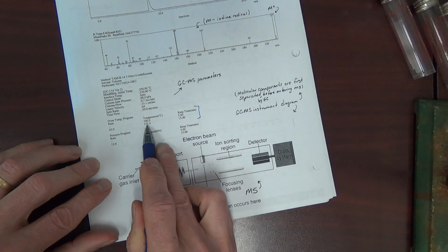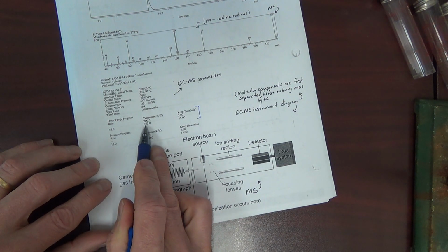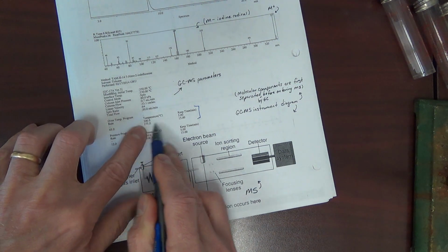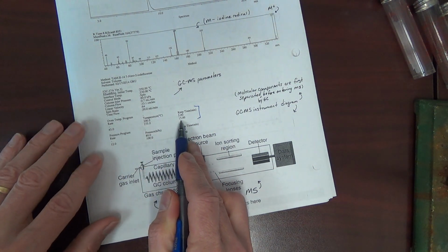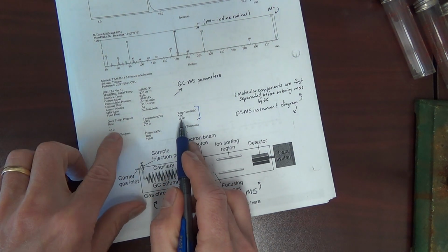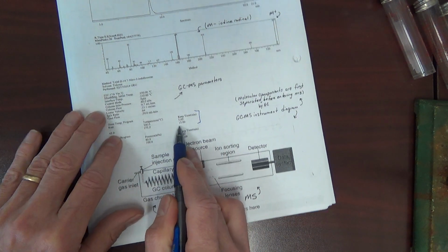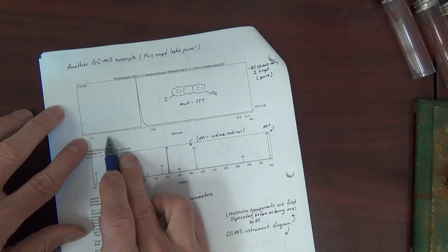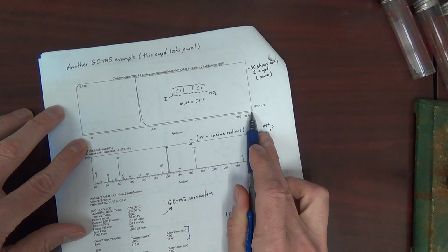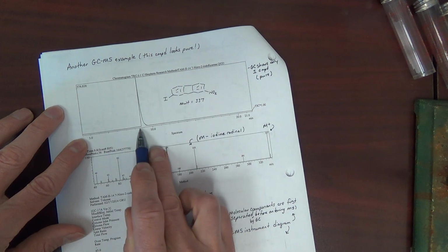Then it ramped up to 275. It ramped at 45 degrees per minute, so it came up to 275 in about 2 minutes or less. And then it stayed at 275 for 15 minutes, for a total run time of just over 20 minutes, including the ramp time. Indeed, if you look at this, this is your time on the column, and you see the GC ran just over 20 minutes. But the compound of interest came out with a retention time of about 9 minutes.